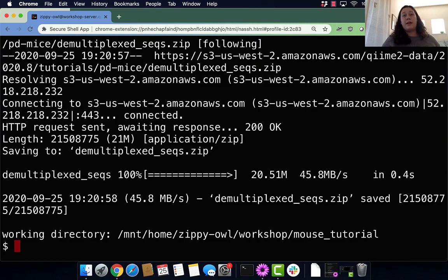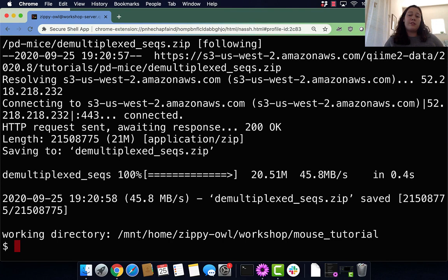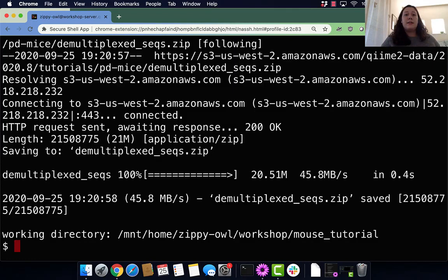Our sequences are amplified using an Earth Microbiome primer and sequenced on Illumina technology. They are 150 base pair reads, and so our sequences will be slightly too short to do paired-end read analysis downstream. They're too short because they aren't long enough to have sufficient overlap. But we can use single-end reads, so we're good to go.